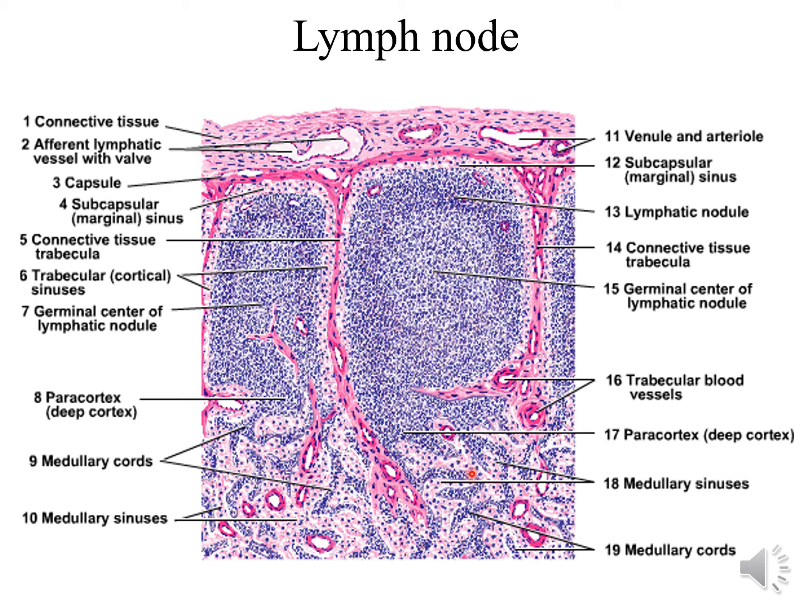And below that, again, as we have discussed, the lymphocytes are present in a branching way, and we name them medullary cords, containing B lymphocytes and also T lymphocytes, and in between them we have spaces. These spaces are known as medullary sinuses, and they are formed by discontinuous endothelial lining, and they also contain macrophages. If the lymph draining into that lymph node is coming from an infected area, we can see different microorganisms present inside, as well as the cytokines.